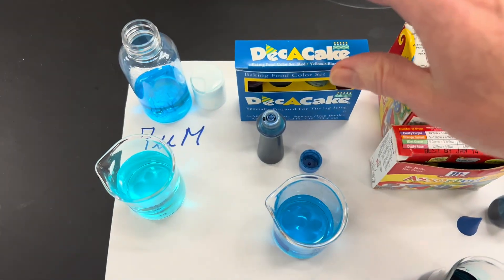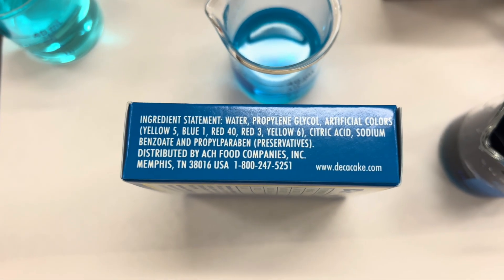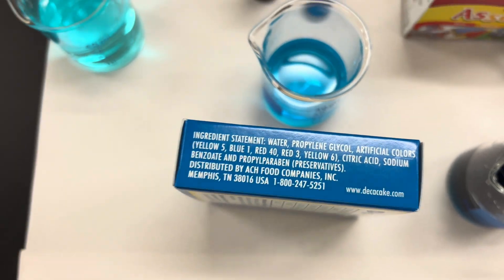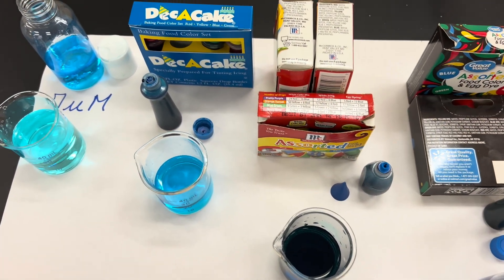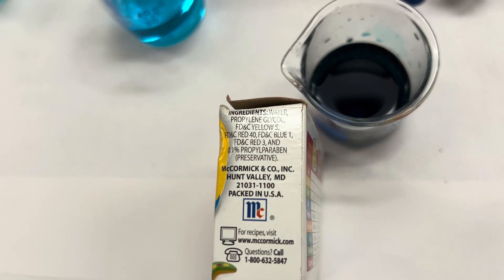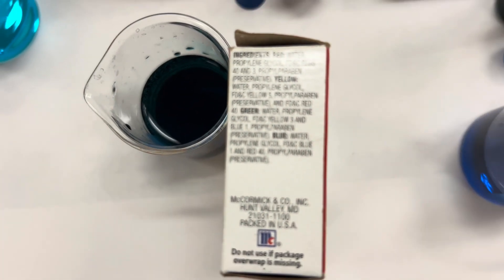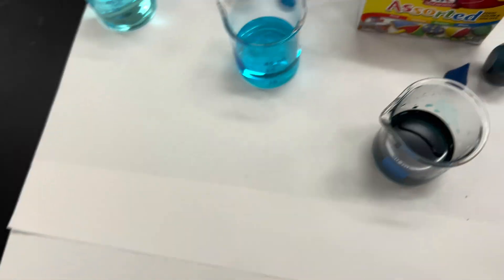Let's start with the DECA Cake. On the label, I'm assuming that the blue has just Blue 1. Now the McCormick — we had a bunch of different boxes. Here's an older box, and then a newer labeled box. And then finally, the Great Value.